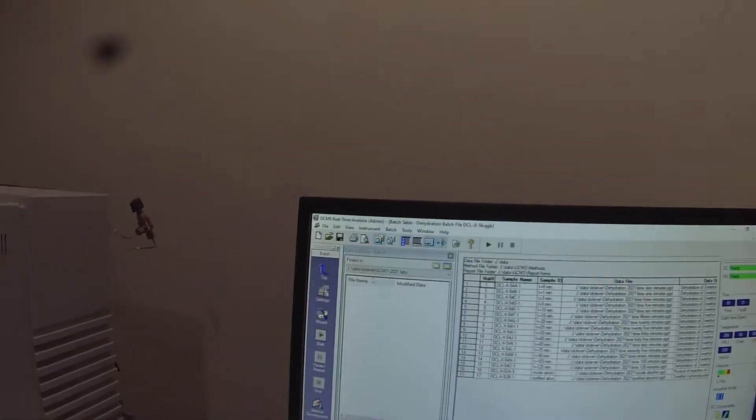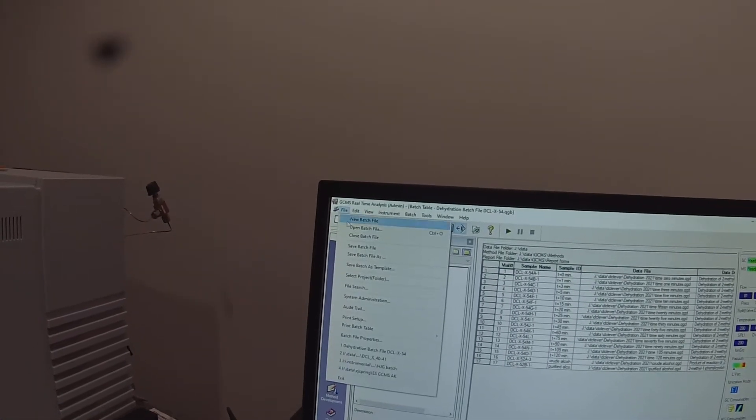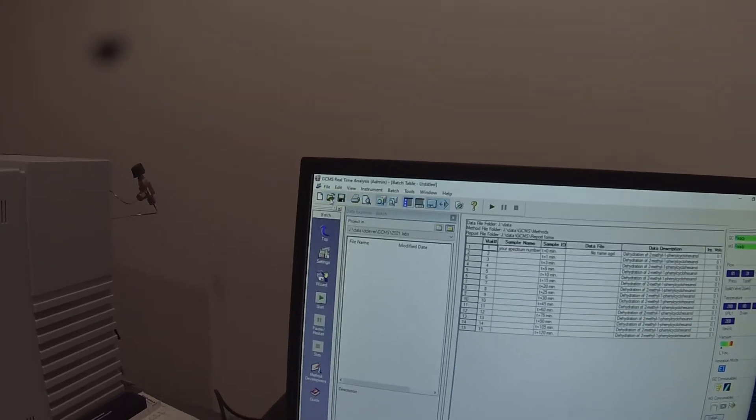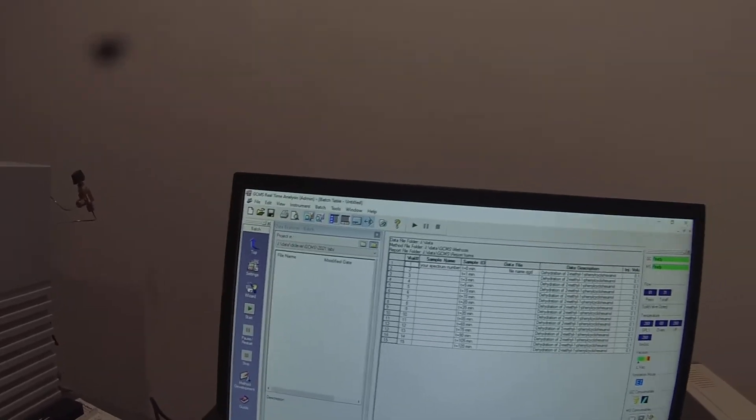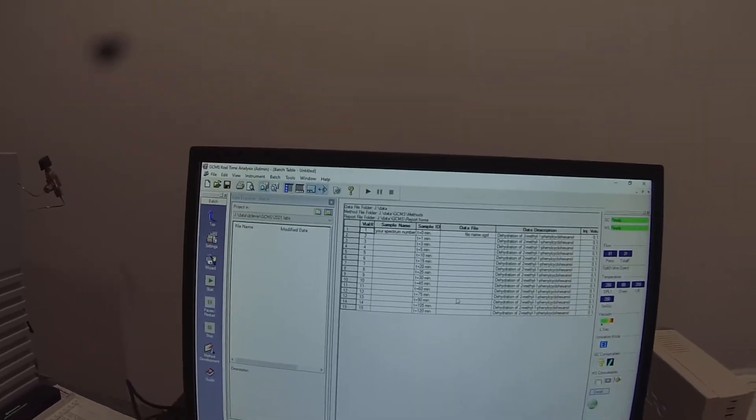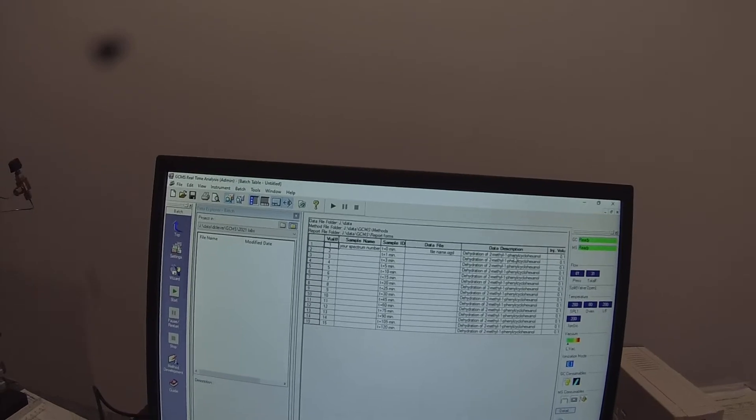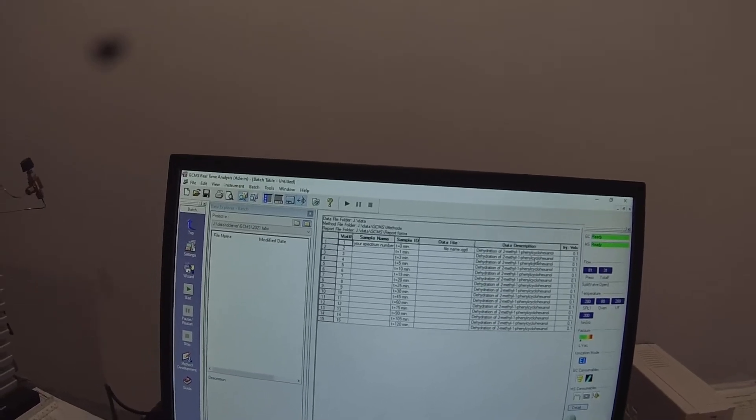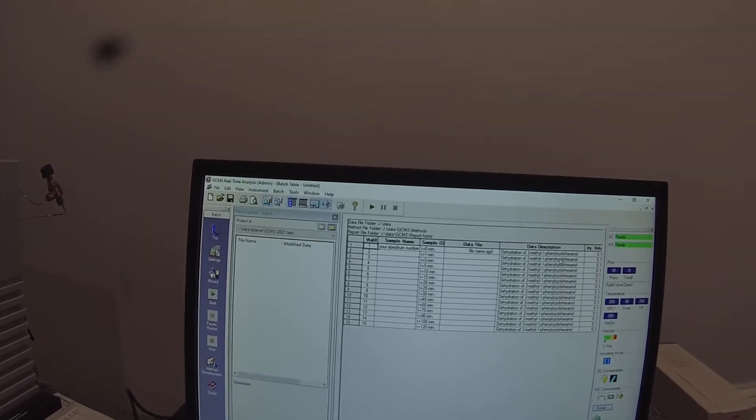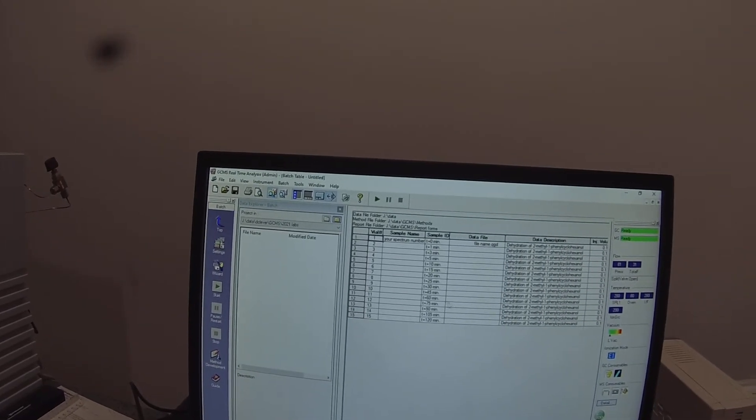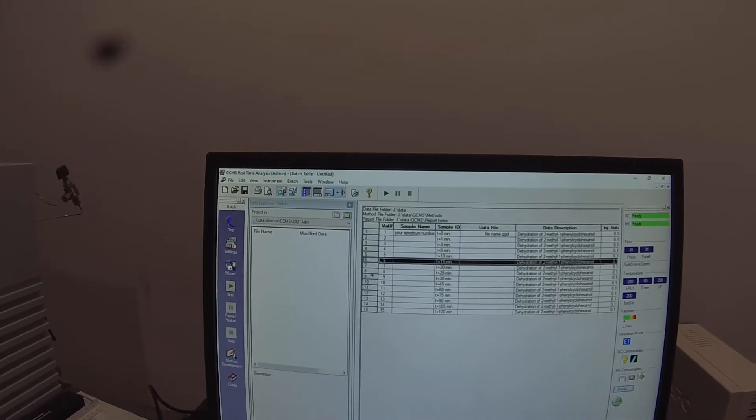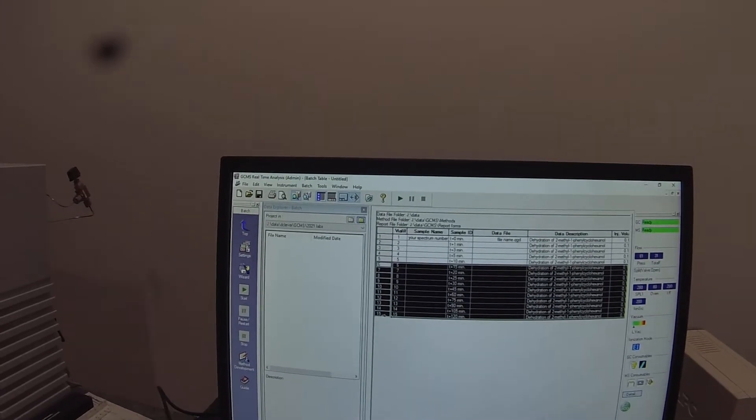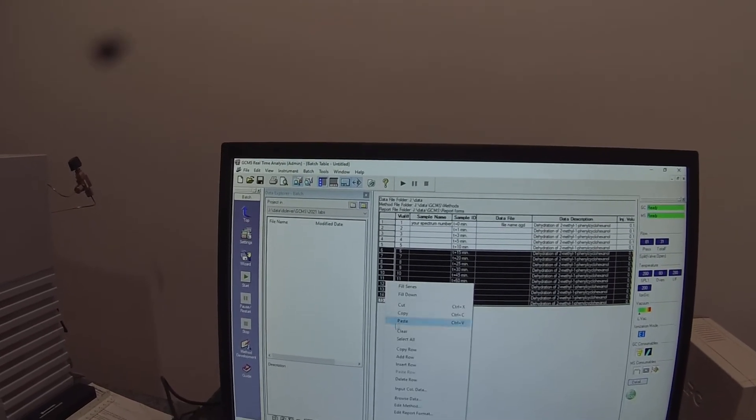And right now there's an old batch file in there. So I'm going to go file, new batch file. And it's opening up a batch file that's automatically set for the dehydration lab that we did earlier in the semester. That's not what I want. I'm going to delete the row by right clicking.